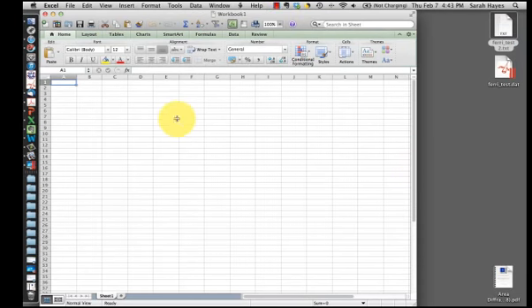All right, so in order to do this next step, what you're going to have to do is make a copy of the data file that you saved from ADM, and then change the file extension to .txt. Excel doesn't seem to want to import the .dat file, but it will do just fine importing a .txt file. But you don't have to do any additional changes to the file itself.